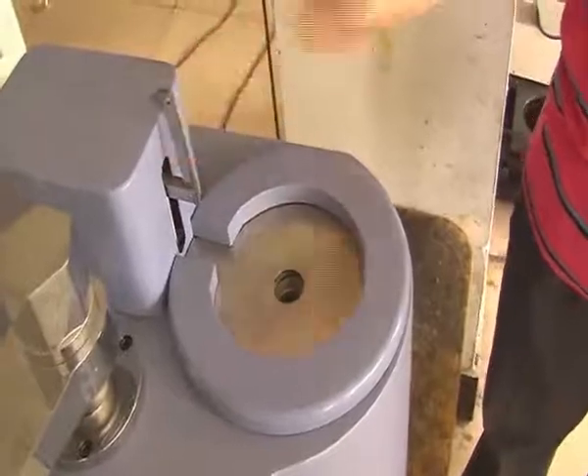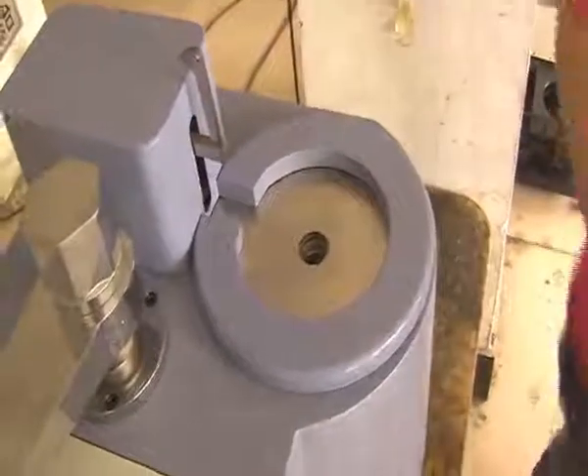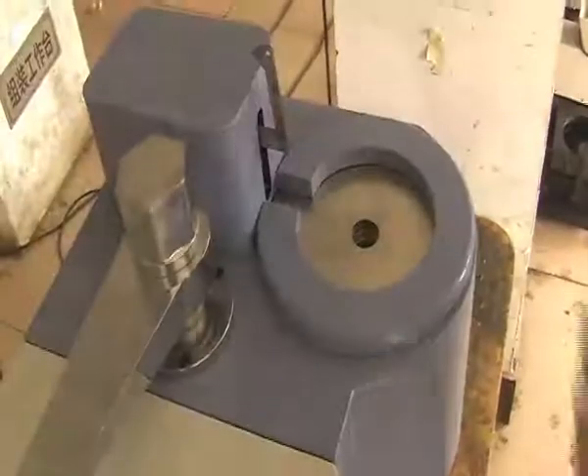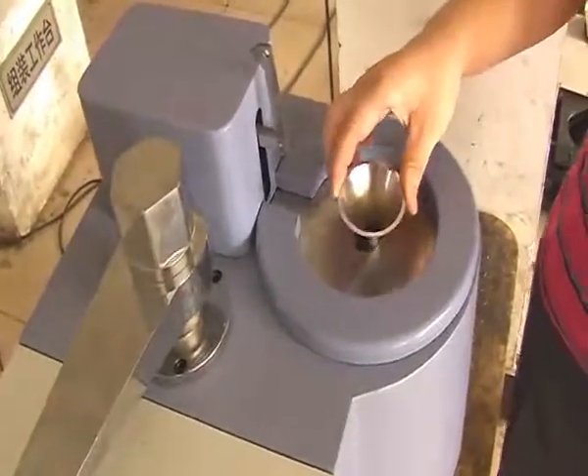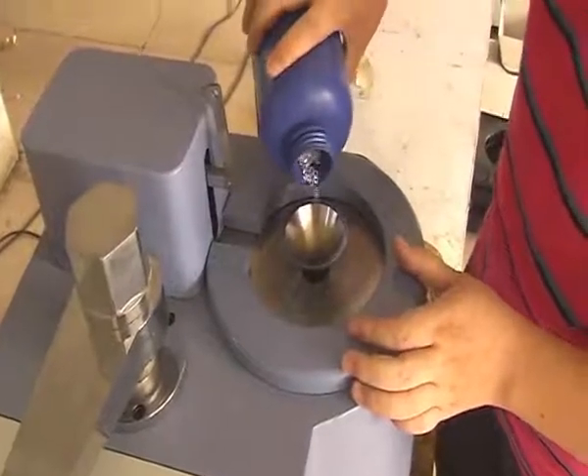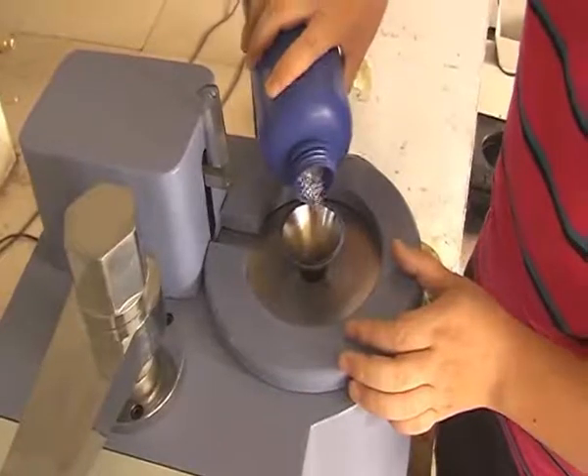When the temperature reaches the constant position, we have to put the material into the charging barrel. First, take the pin vertically, then place the funnel. Second, put the material into it, and take away the funnel.